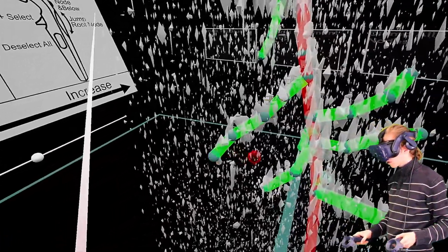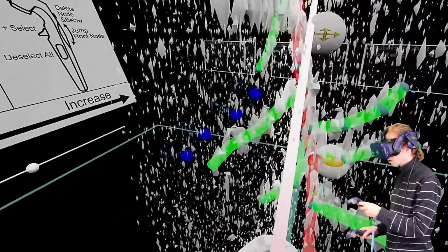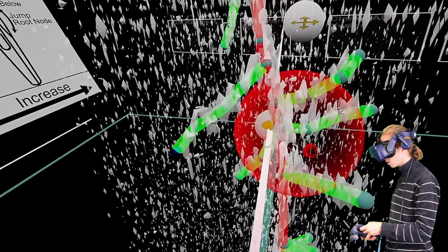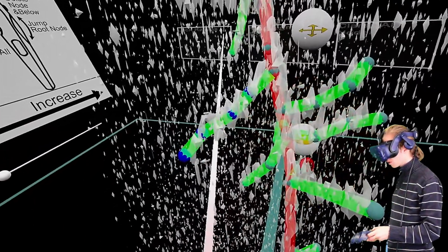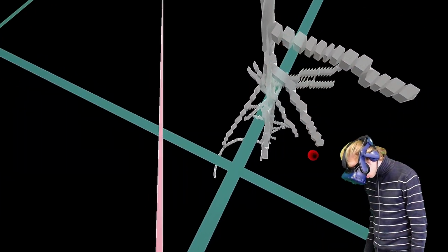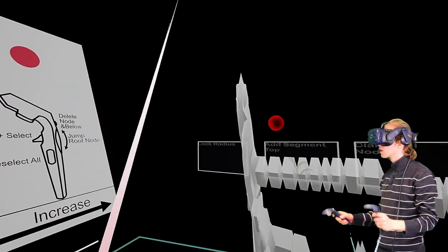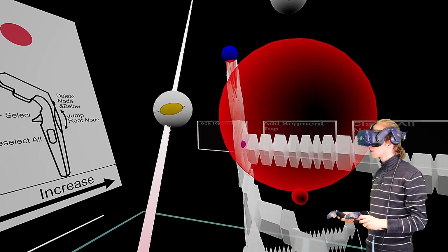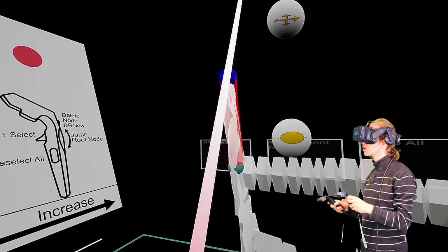For dense annotations, as well as to adapt the whole organ at once, the editing widgets on the side always manipulate the current selection. They typically float next to the most recent addition to the selection set. This is a good way of fine-tuning the position and diameter of the segments. A good way of tracing a root system is by tracing the taproot very finely, by placing a lot of nodes into it. This not only helps with attaching laterals without needing to add nodes in between, but also makes the navigation through the root system a bit easier.